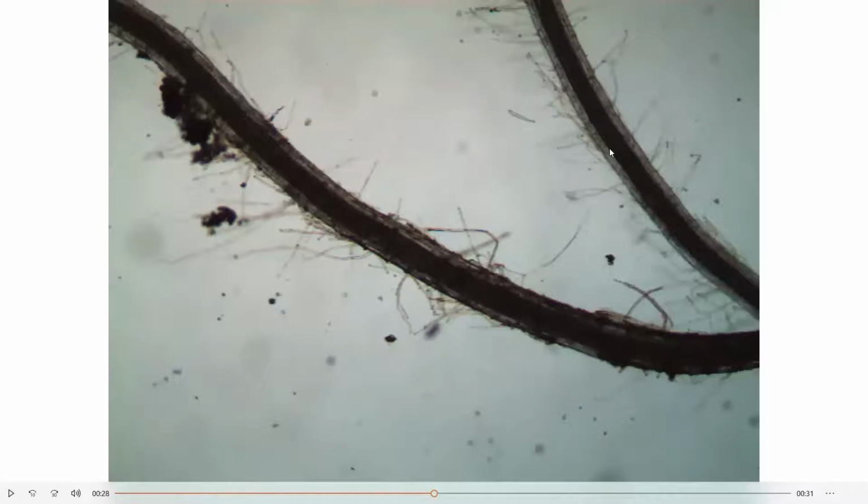This is a monocot, and monocots do have branching roots. But this is not a branch root. This is probably one of the roots that are forming from what's called adventitious root growth. So the roots of monocots tend to be more fibrous than in dicots, which have more of a taproot system. And so this is just the beginning of the many, many roots or adventitious roots that are going to be formed as the plant develops. But let's follow the rest of the root here.